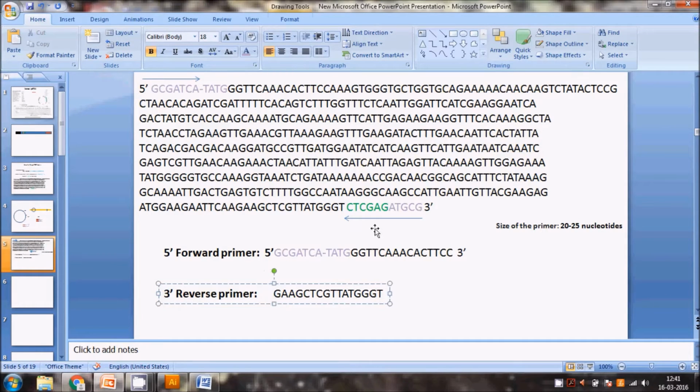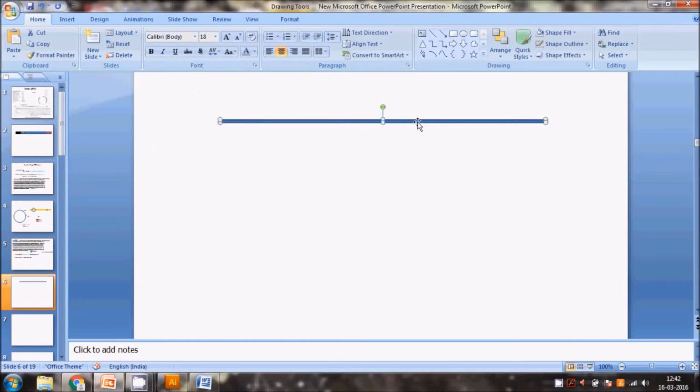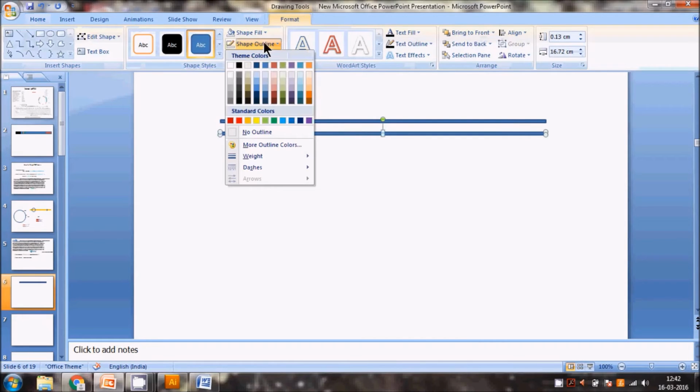And you probably know that this segment is from 3' to 5', right? But we want something in the 5' to 3' direction. Okay, so I will show you with another example. This is one segment. This is another segment. Not here, sorry, it should be here somewhere.